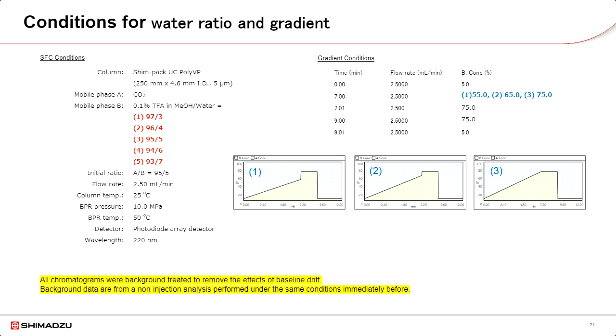Owing to the relatively poor performance of acetic acid as the acidic modifier when subjected to further optimization, the choice was made to do gradient optimization only with TFA, with gradient endpoint being set at 55%, 65%, and 75% to induce a different slope and potentially alternative separation.